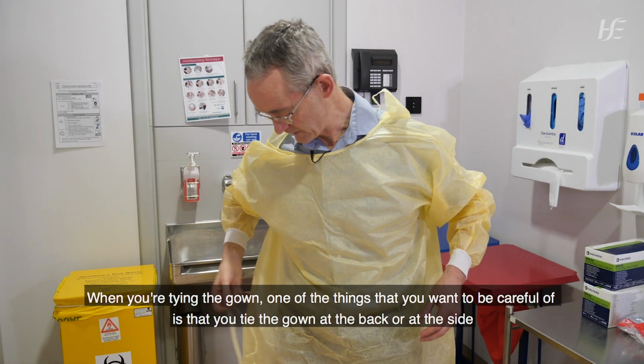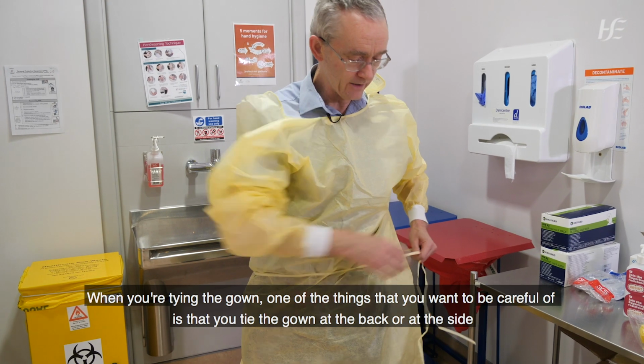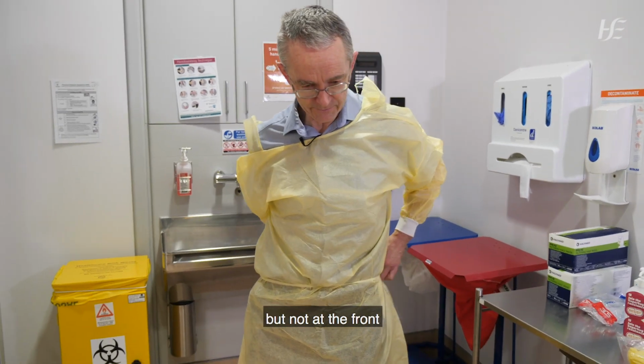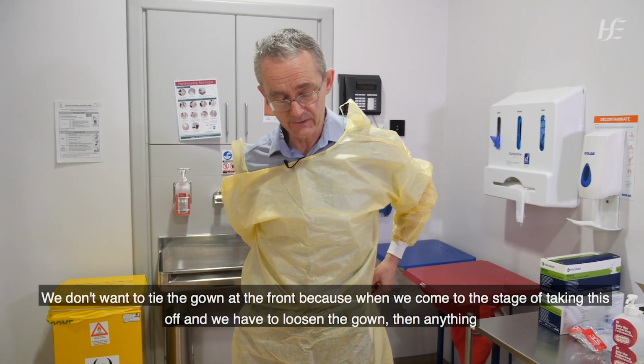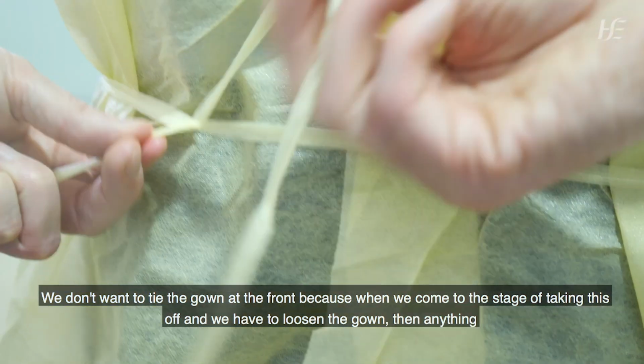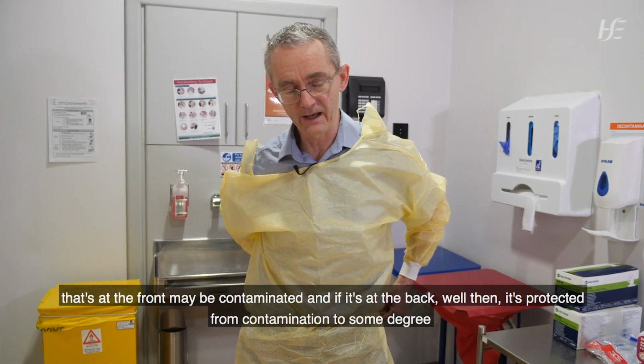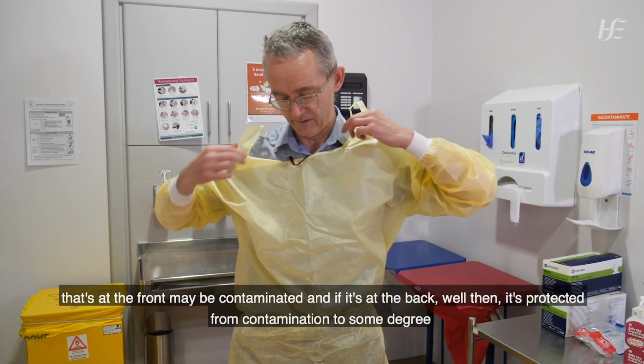For tying the gown, one of the things that you want to be careful of is that you tie the gown at the back or at the side, but not at the front. We don't want to tie the gown at the front, because when we come to the stage of taking this off and we have to loosen the gown, then anything that's at the front may be contaminated, and if it's at the back, well then it's protected from contamination to some degree.